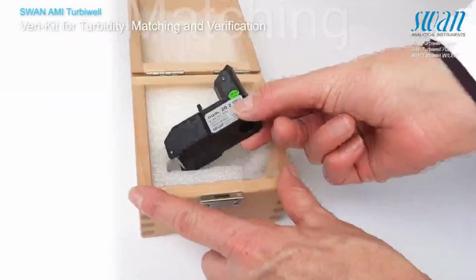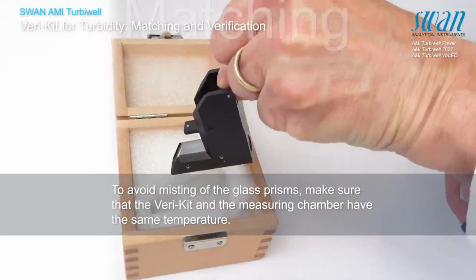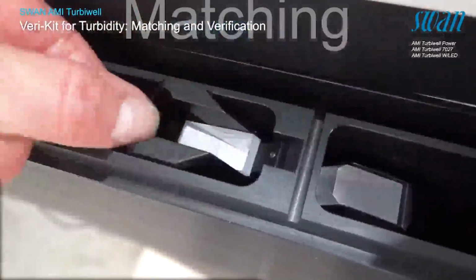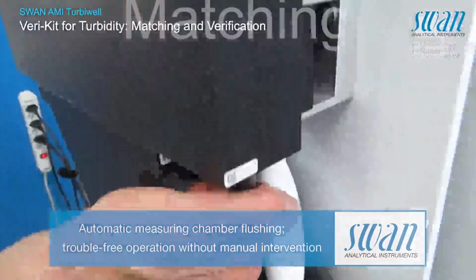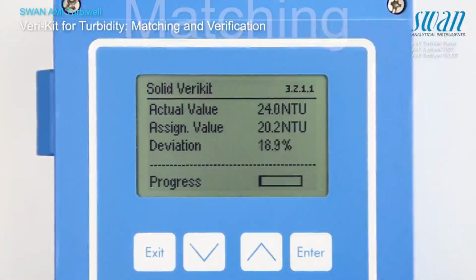Carefully take the VeriKit out of the box. Avoid touching the optical surfaces when working with the verification kit. Insert the VeriKit and ensure that it is fastened correctly. Close the measuring chamber and start the matching by pressing Enter.